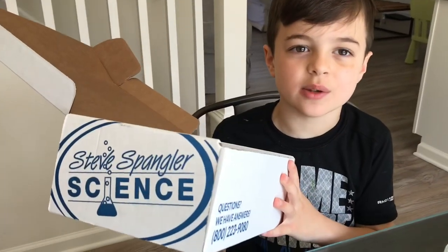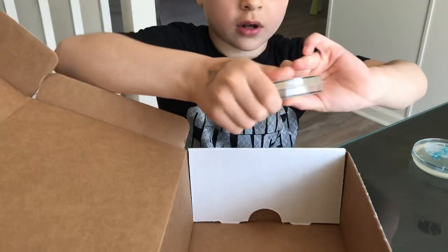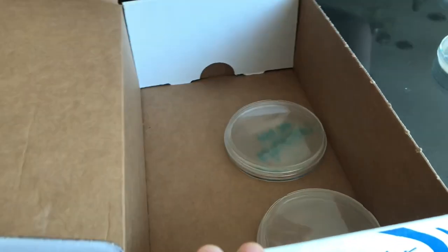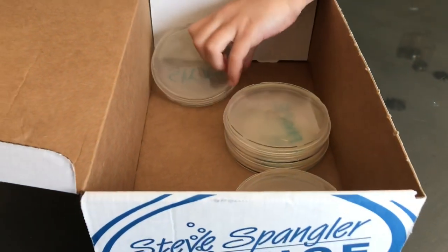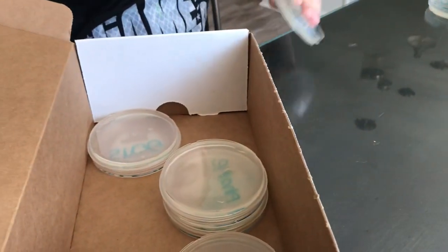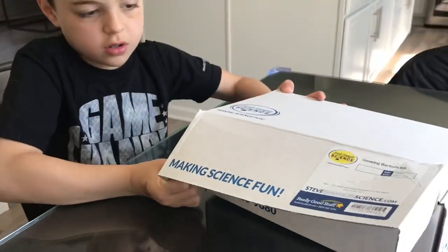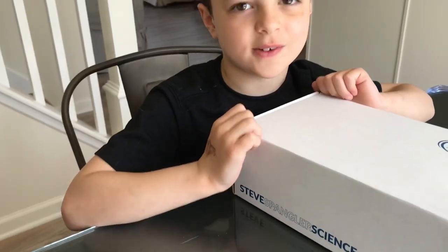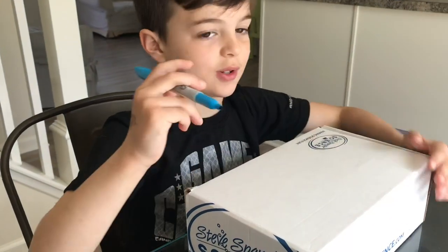We're going to use this box as an incubator. You're going to turn them upside down — be very careful. This way the moisture does not get onto the bacteria. Spread them out. Good. Now it's stored where it's really warm. Wait about a week until we come back. Do not touch.